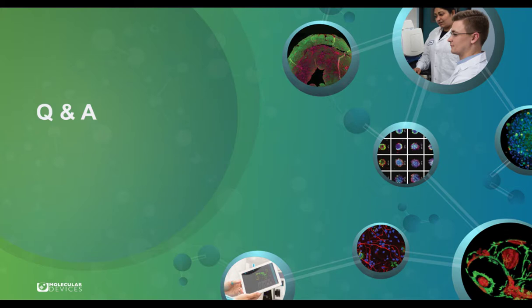Thank you, Dr. Tang. Now, can the measurement and result sheets be changed or modified? No, the result or the measurement cannot be changed. It cannot be changed in the analyzed result or data set result, right? I think that is a good thing, right? So it's not changeable.